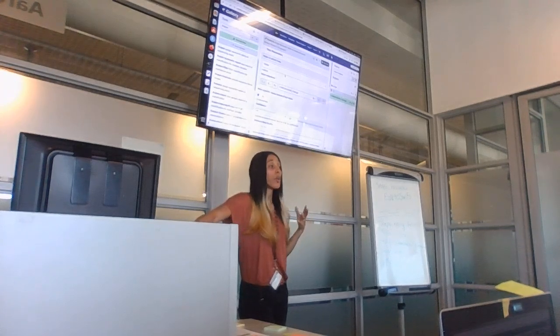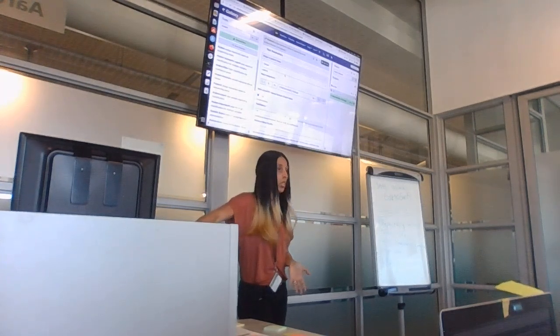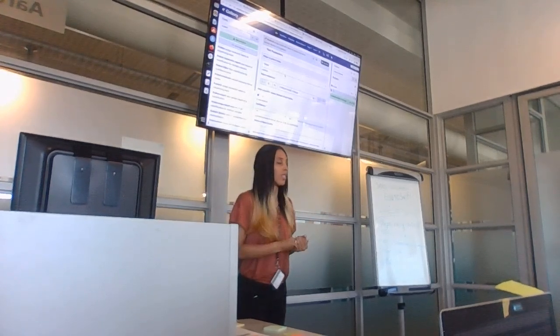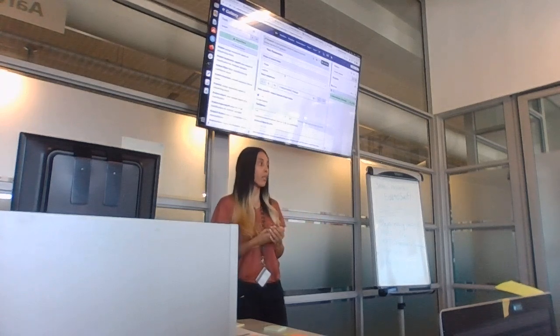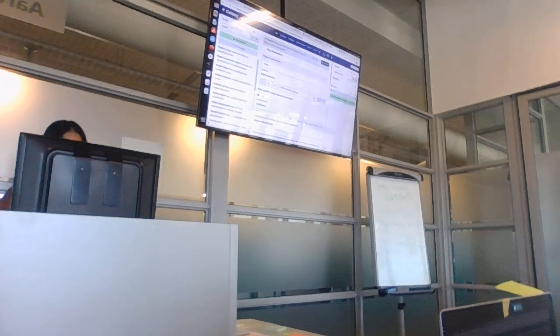So it doesn't matter. If you want to be thorough, you could do it on both, but like I said, Kraken runs exceptionally long. So I would only do it on the other one if I'm not getting anything that makes sense to me and I want to check the other one also, but I would select either one of the two. So basically you would fill out this here.